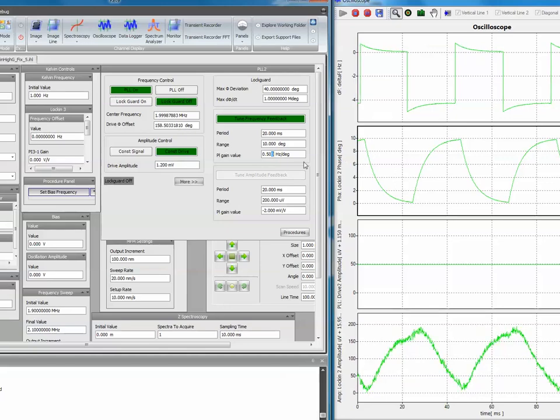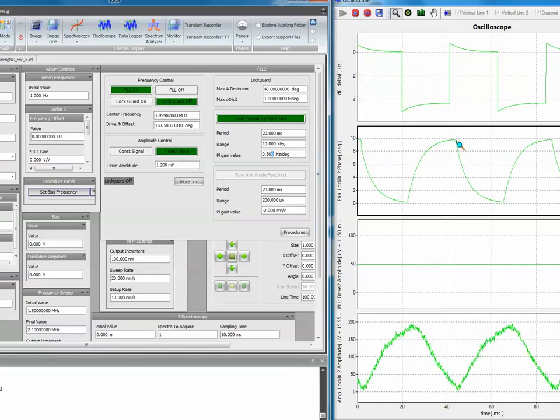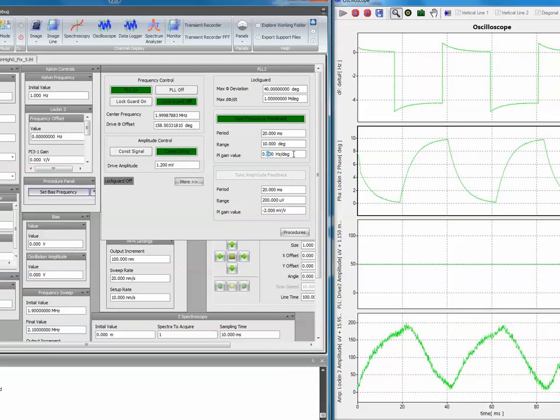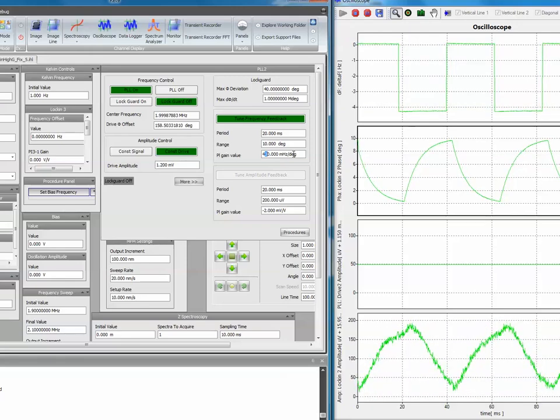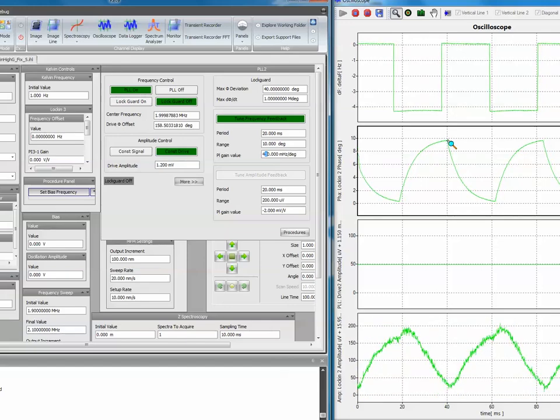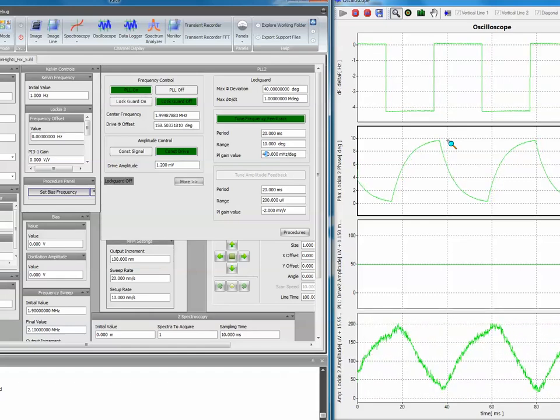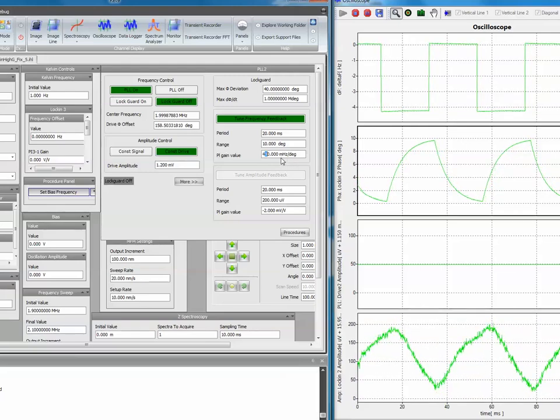If we set our gain to 500 millihertz, we can see that something is happening at the phase already, and also something is happening at the delta F. Now you might think that this is the optimum value because the delta F, let me tune this a little bit, the delta F looks pretty square, but the phase is not square at all. What we try to do is get the phase as square as possible. There will be peaking at the delta F. I'll explain that a little later. This is a good starting value, but it's still way too low.